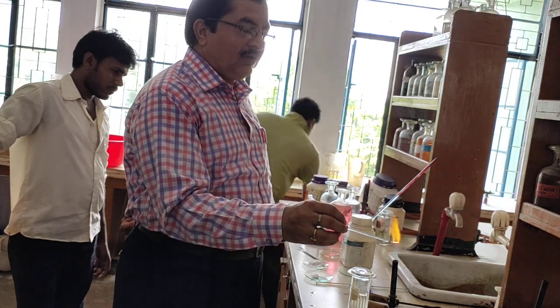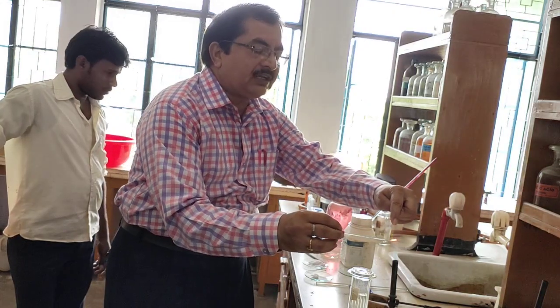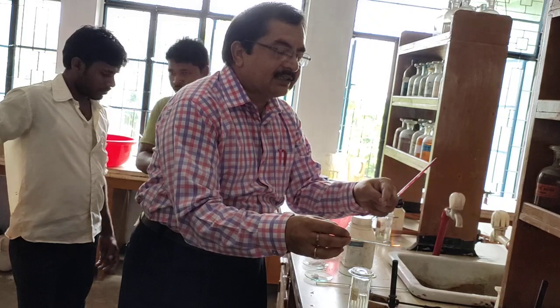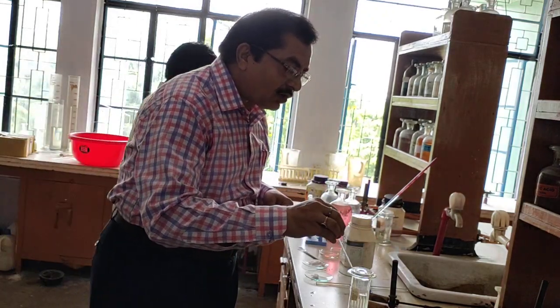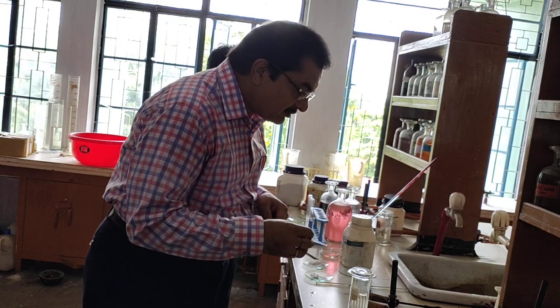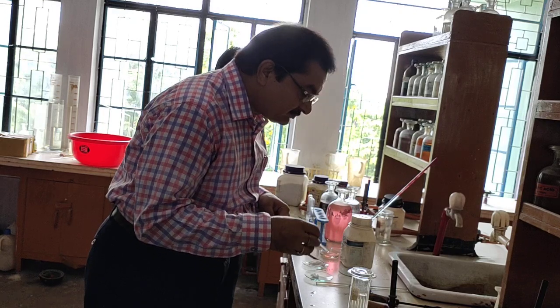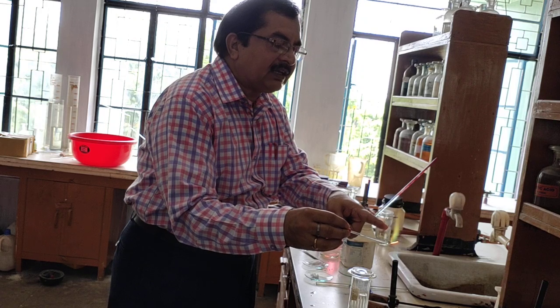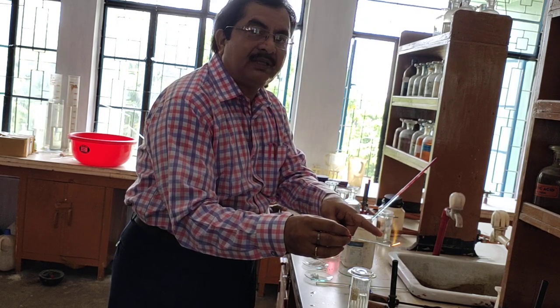See, you will find the color of the flame. See here, at the tip of this flame, greenish color is coming. Here green color is coming. Grassy green color. This grassy green color shows the salt of barium maybe. See, on the tip, grassy green is coming, very clearly grassy green is coming. This grassy green color shows that salt of barium maybe.